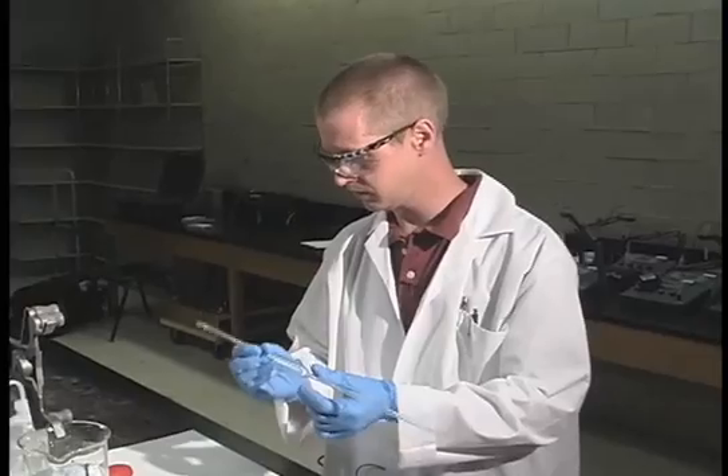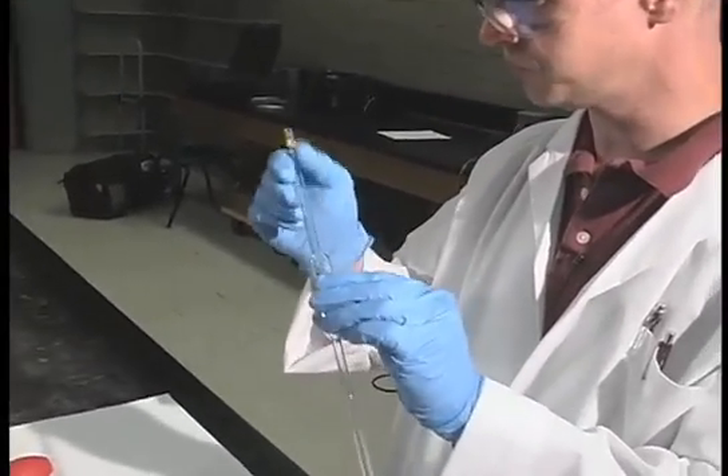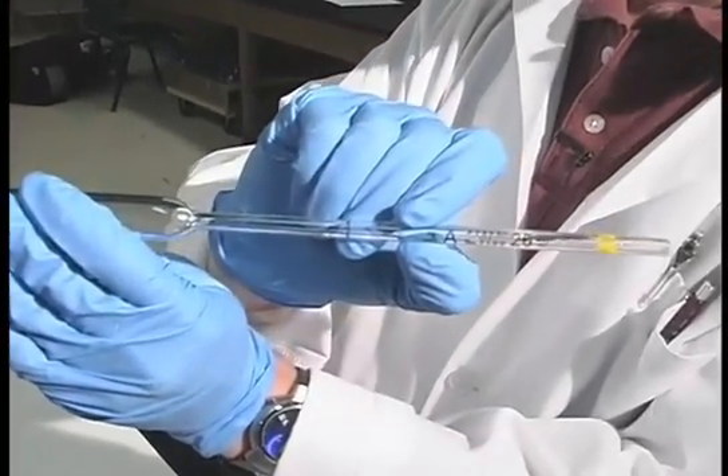The first technique we're going to learn is how to pipette. Pipettes are constructed and calibrated either to contain or to deliver, and this particular one is to deliver — you can see there's a little 'TD' on there.